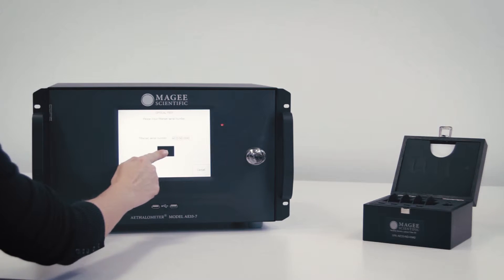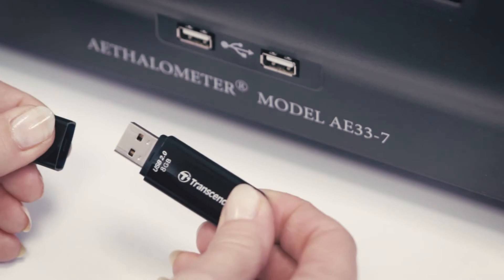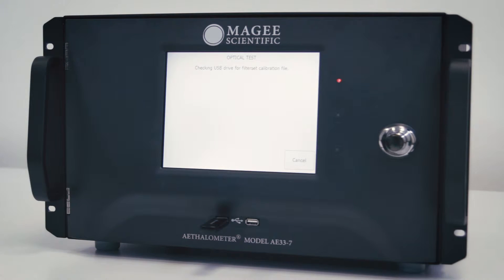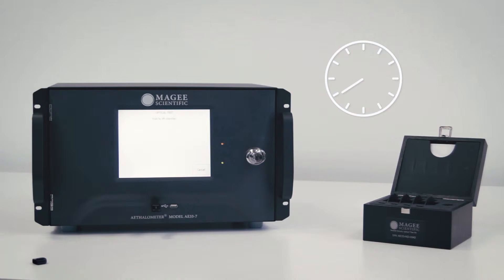The instrument will prompt you for a file of calibration parameters. If you're doing this test for the first time on this instrument, you'll need to upload the files from the USB stick that is in the ND Kit box. Insert the USB stick into the USB port on the front panel and press Yes. The instrument will copy the calibration parameters file and then start the test procedure.